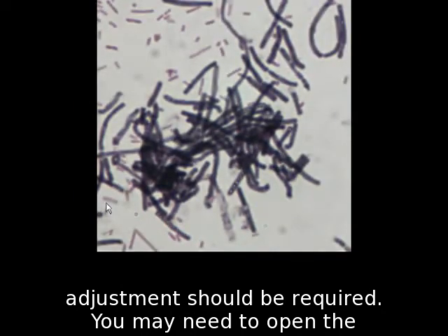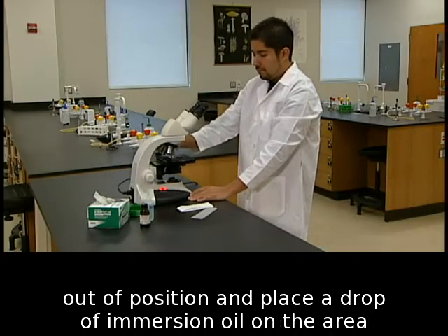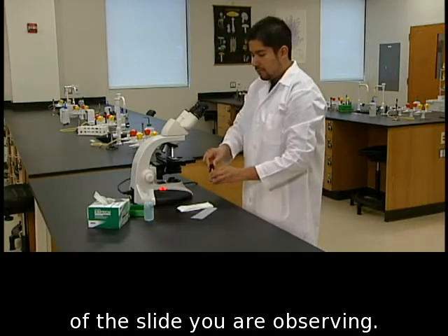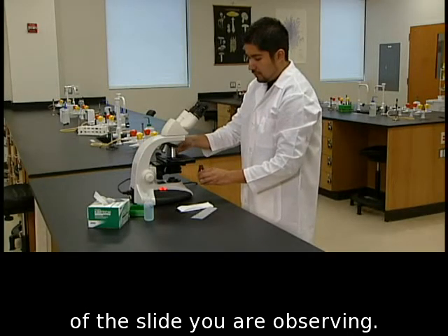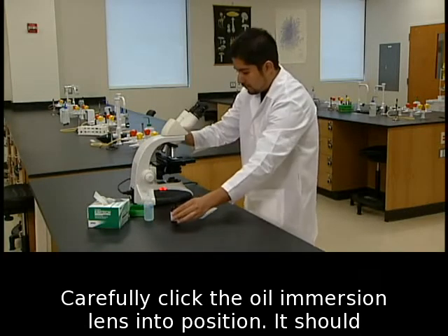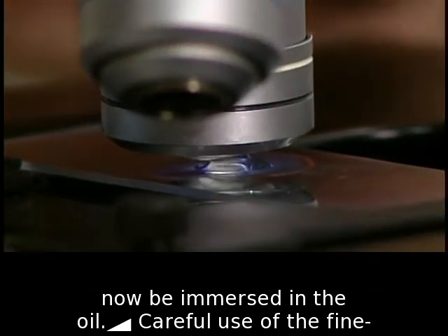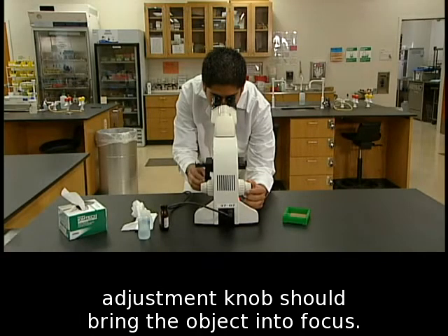You may need to open the diaphragm a little to get more light. Move the high dry lens out of position and place a drop of immersion oil on the area of the slide you are observing. Carefully click the oil immersion lens into position — it should now be immersed in the oil. Careful use of the fine adjustment knob should bring the object into focus.